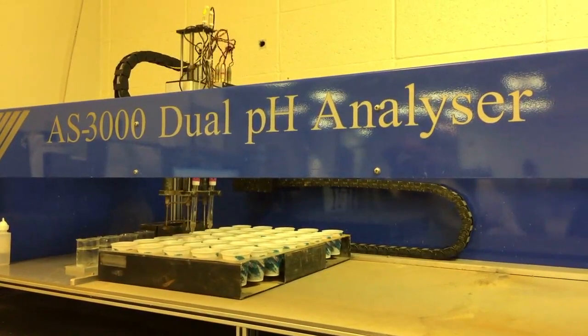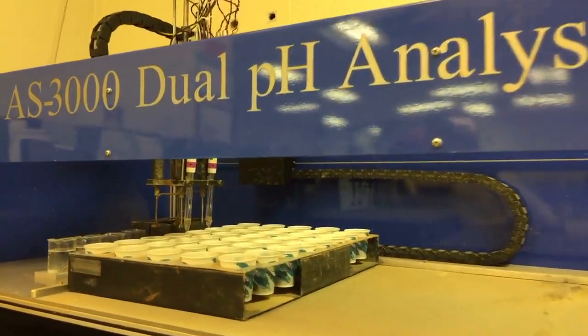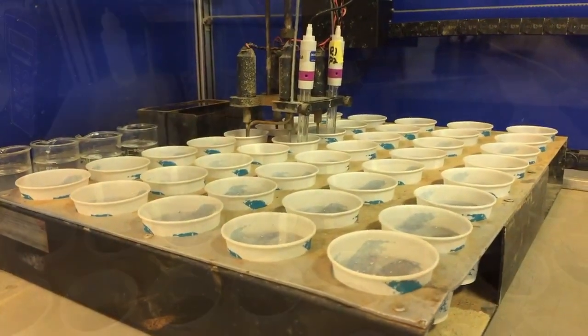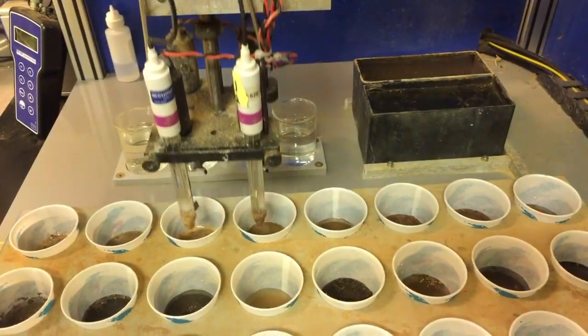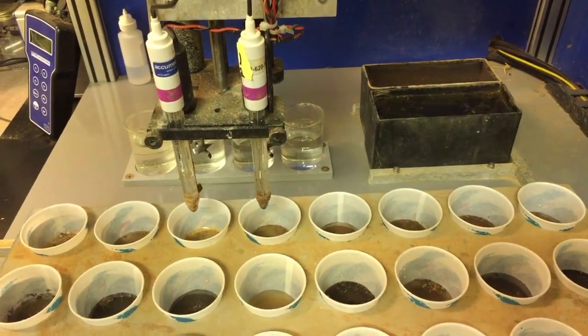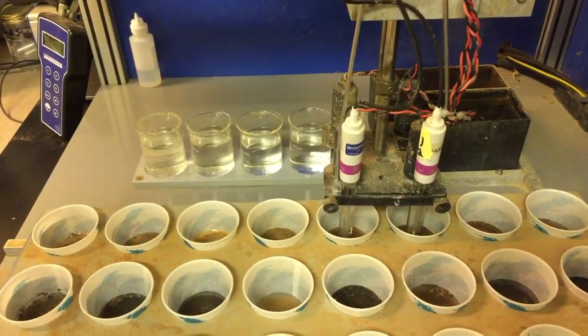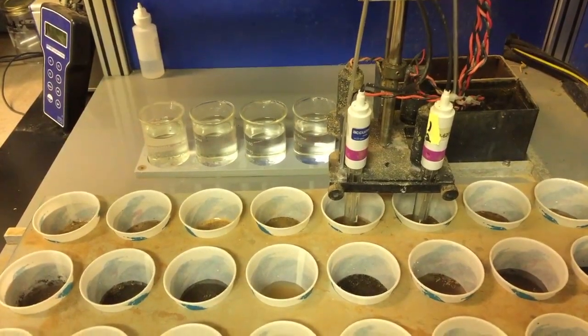Meanwhile, the other batch is being tested for pH level. This machine not only measures soil pH, it also injects calcium hydroxide into each sample and monitors how each sample reacts uniquely. Different soil types are affected differently by the addition of lime, so this test ensures the lime recommendation is exactly what your soils need.